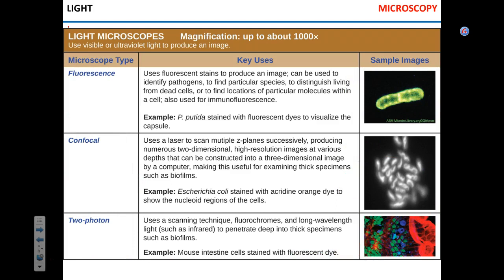Fluorescent microscopy. Now, as you go from bright field to phase contrast to fluorescent microscopy, the price of the equipment rises, obviously. These microscopes run, I think, about... if you took AP1 or AP2 in these new classes, these new microscopes there run for about $2,000.